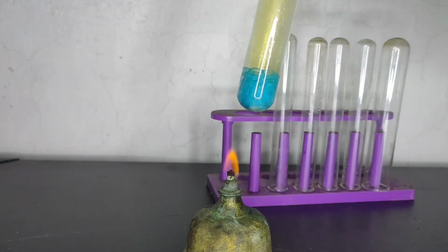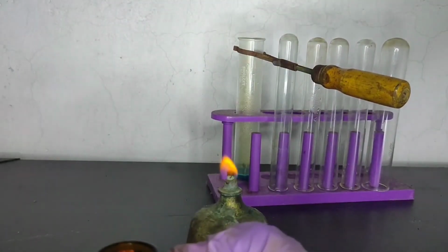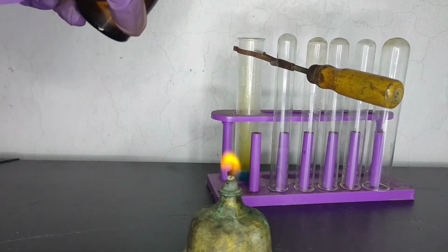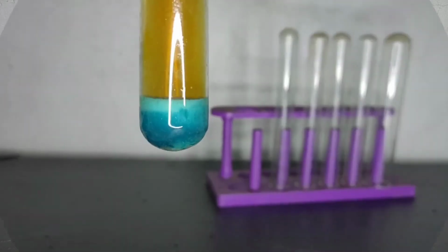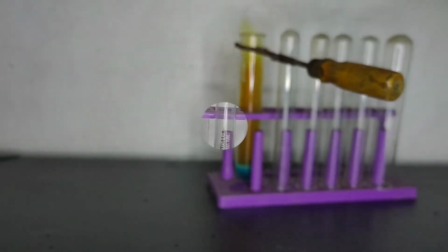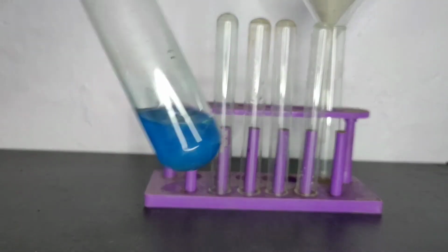I kept it heating for some time until I thought that all the nitric acid was consumed. Then I added additional nitric acid. 1 ml of additional nitric acid was added. One ml more nitric acid was added. So total of 2 ml additional nitric acid was added. And you can see now the ring is coming to dissolve. After some time, the ring dissolved completely and some insoluble impurities were left, which were non-metallic.